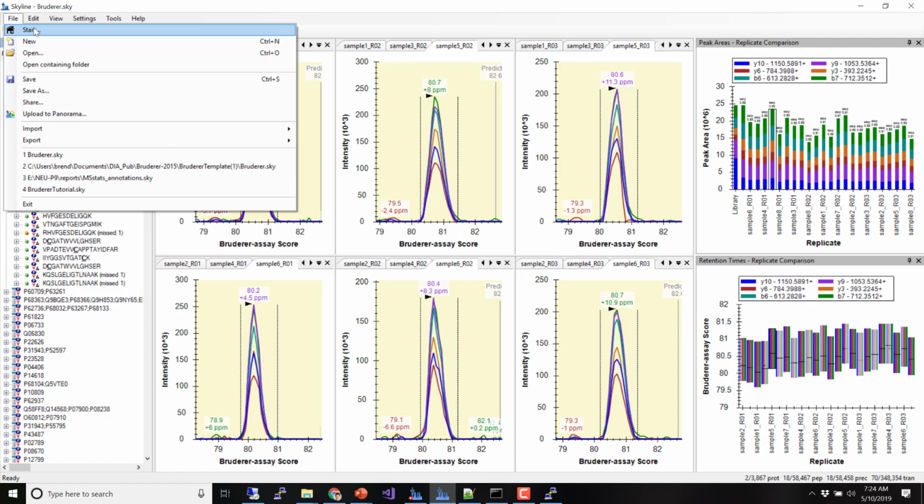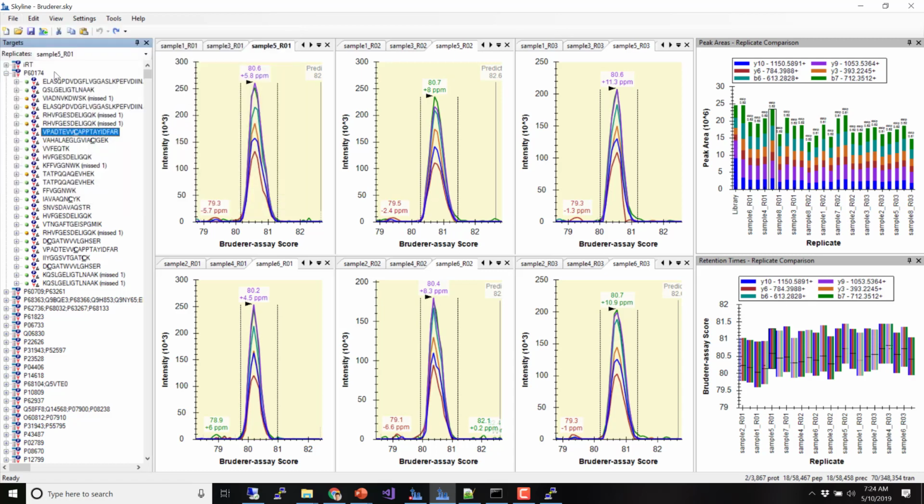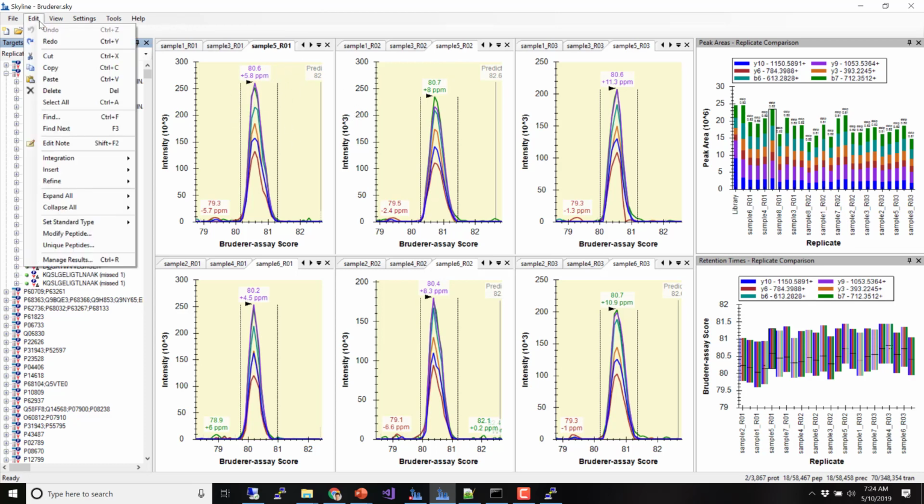People say it, but it tends to end up being centroiding. If you haven't heard the term before, people will say, "Oh, and then we did peak picking," which really just means that they took a profile shape and turned it into a stick. So I try to talk about centroiding, and I use peak picking only for the retention time chromatogram peak picking.